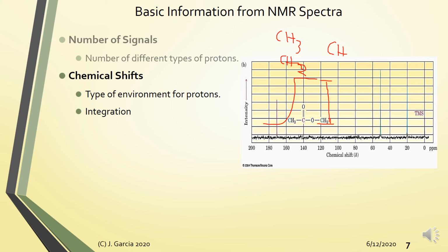Or if you don't have an integration, ay, hindi pala lalabas yun dun sa carbon-13 NMR, kasi we are only talking about the proton. So the integration gives you information about the proton itself, kasi usually yung signal sa proton NMR talks about the nature of the neighbors, yung neighboring atoms. But the integration tells you information about the proton itself. Okay? So kung methyl, methylene, or methine yung signal mo. Then also the ratios of the number of protons.